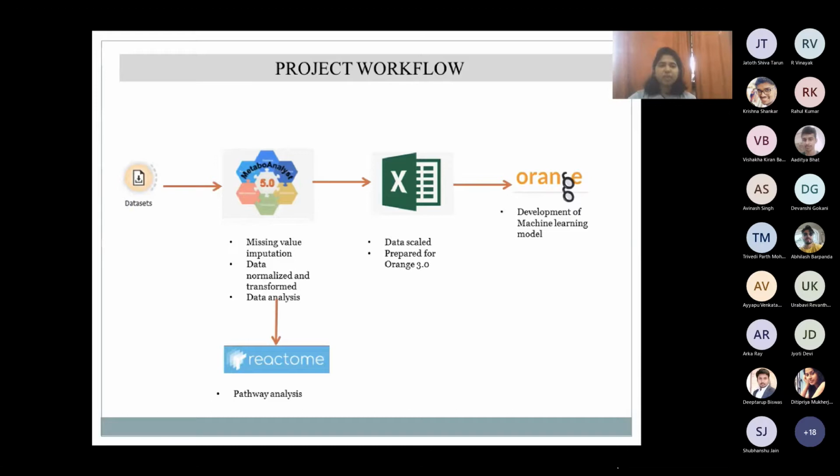The normalized data that we received from MetaboAnalyst was then scaled and prepared for uploading in Orange using MS Excel. The normalized data, which was also scaled using MS Excel, was then uploaded in Orange for development of machine learning models.